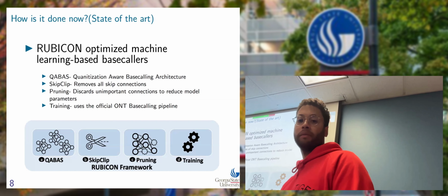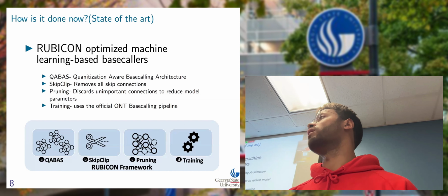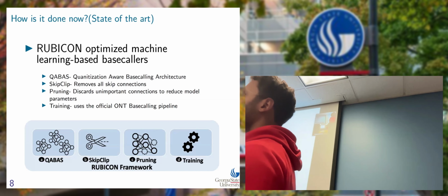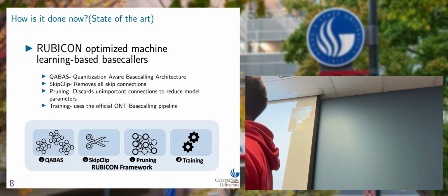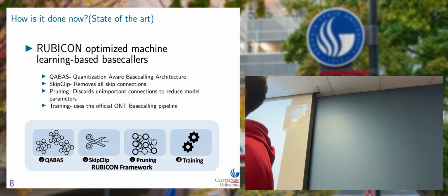Make sure you run one of these: Bonito, Dorado, Rubicon, if you want. There are many variations. There is also one from Google, very lightweight for small devices. So you can try any of those. But I would recommend the Nanopore one, Dorado. Gotcha. Okay.